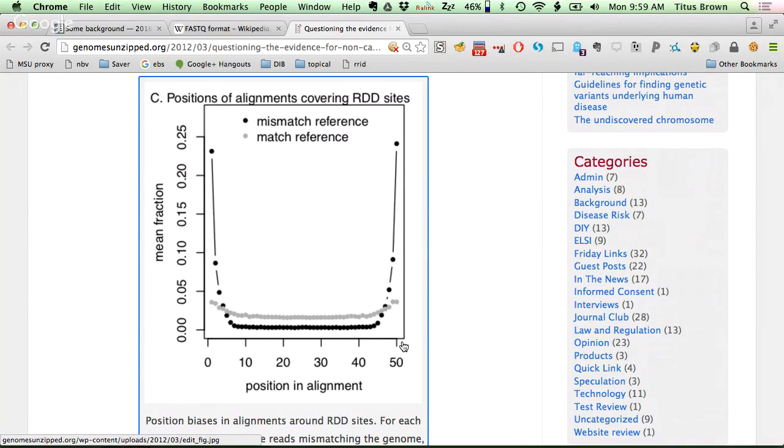So something that I didn't have a good diagram for, but in general, shotgun sequencing is selected randomly from your genome or your transcriptome. So you wouldn't expect to see at position 30 in your reads always the same kind of error, always the same kind of difference.